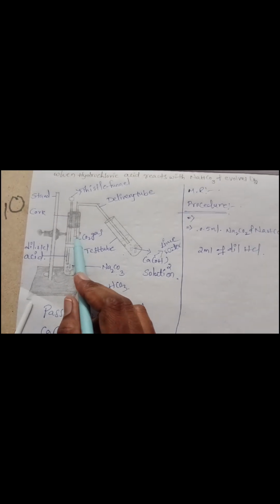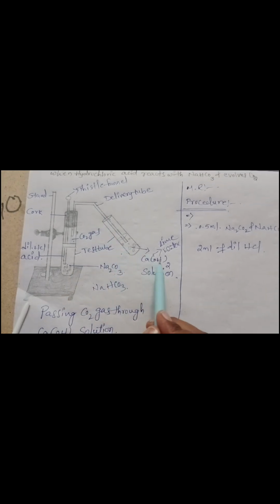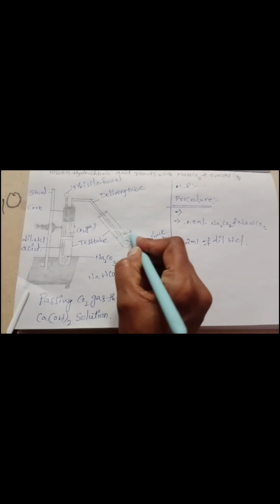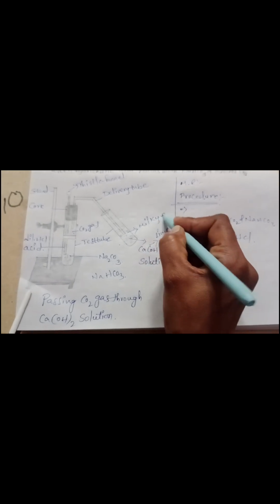We pass that carbon dioxide gas through the delivery tube into the lime water. When it enters the lime water, the lime water turns milky white.